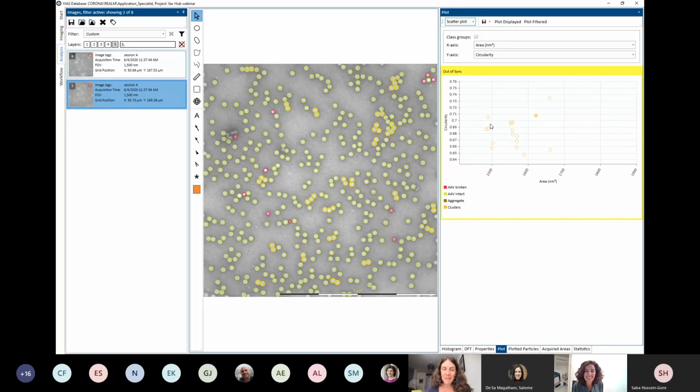So I work at UCL. In my lab, we do quite a lot of EM. We're looking at different types of protein nanoparticles, tubular structures, and microcompartments. And what we struggle with a lot, well, not time-wise, is the data analysis. So we also do a lot of sectioning through bacterial cells.